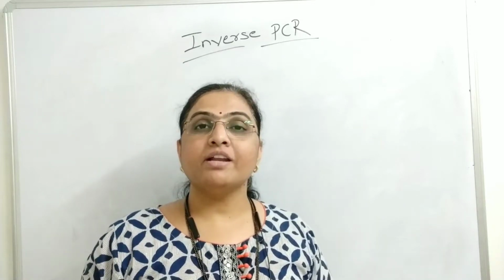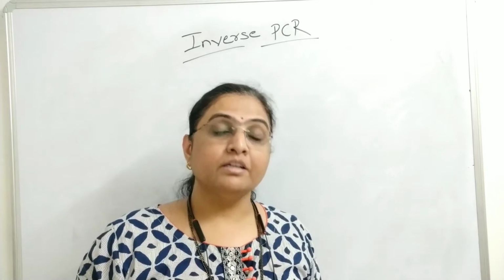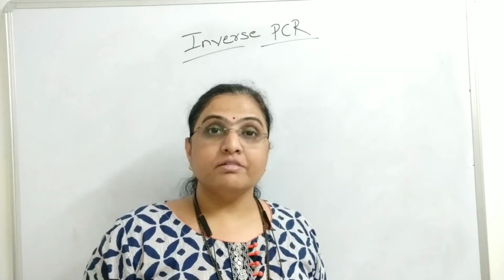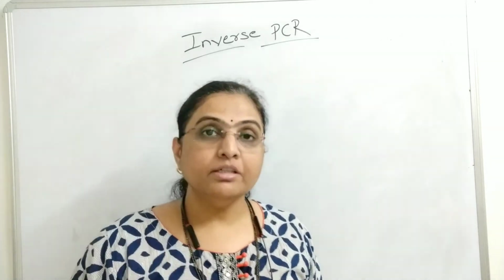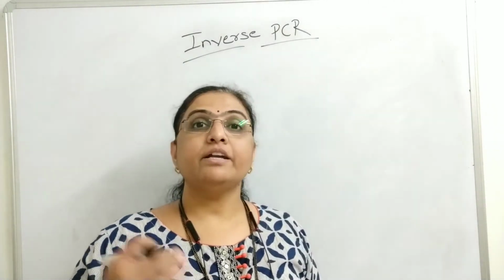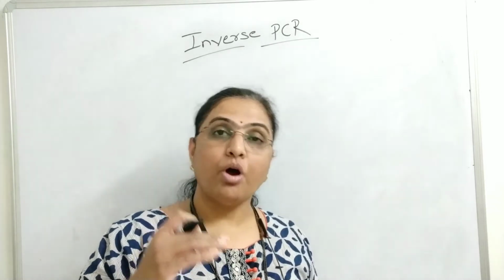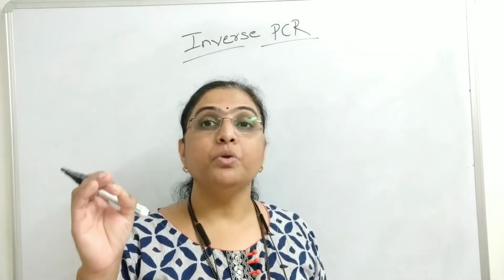From the last video we are learning about the PCR. We have learned about the basic principle of the PCR, and also we have covered the primer designing. Today's video is concerned about the inverse PCR, which is a type or variation of the PCR. This inverse PCR is also called the inside out PCR. Inverse PCR is used for the amplification of DNA whose sequences are unknown.